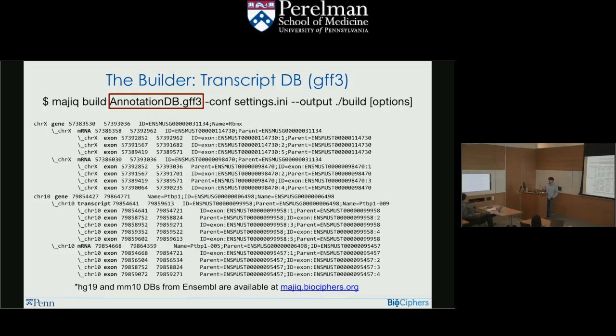I don't know, because that's a good point, because we expect that the junctions always go forward in sequence. We expect that the junctions are always splicing forward, so the start of the junction and the end of the junction is always going to be in a forward direction. If we splice someplace before in the transcript, I don't know if it worked. I'm not sure. It's worth a try, but I cannot tell you what would happen right now.